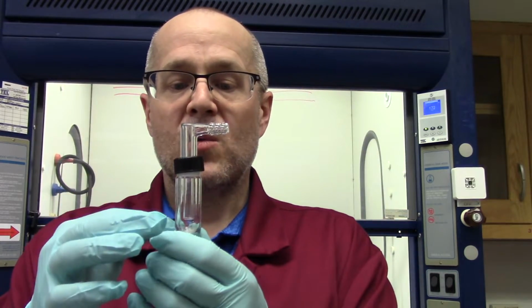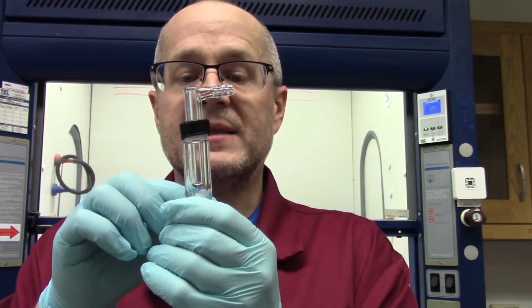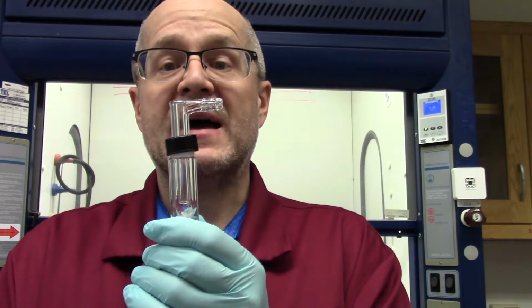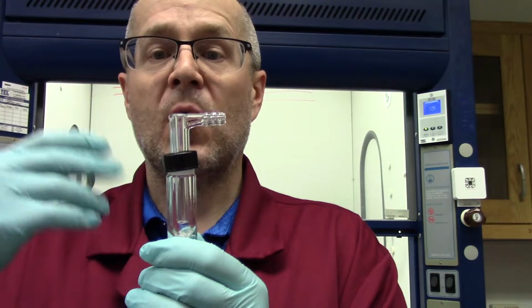What happens as you pull a vacuum and apply heat? The material that I've already weighed out at the bottom, 26 milligrams, will heat up and sublime. It'll give off gas. That gas will get to the cold finger and it will deposit itself on the cold finger.